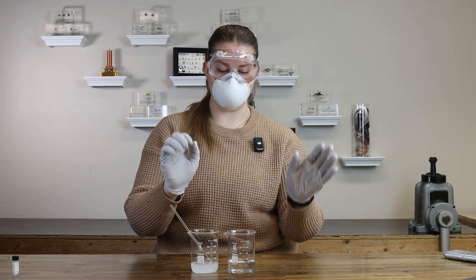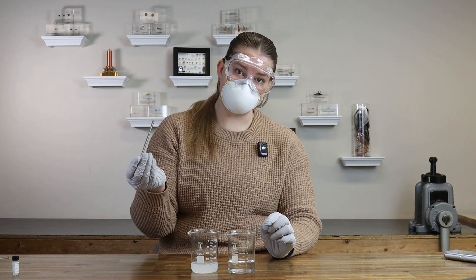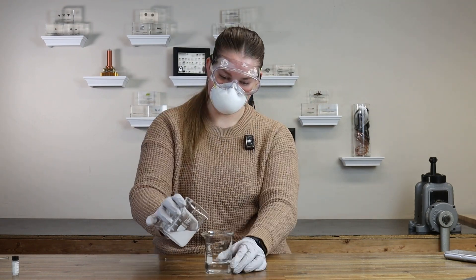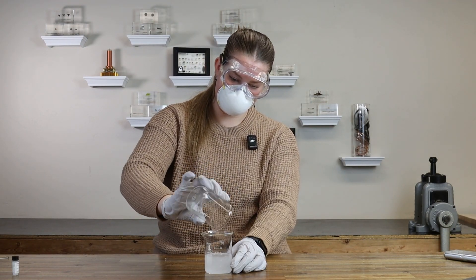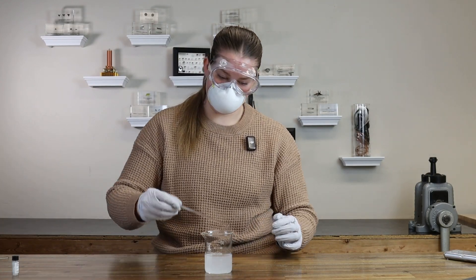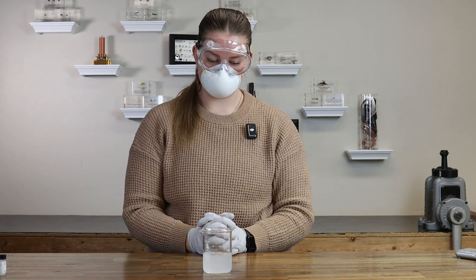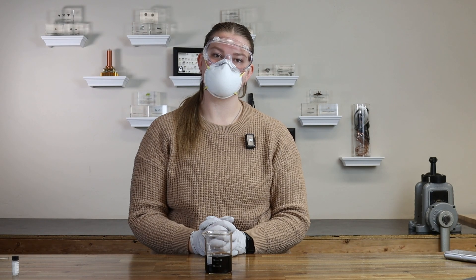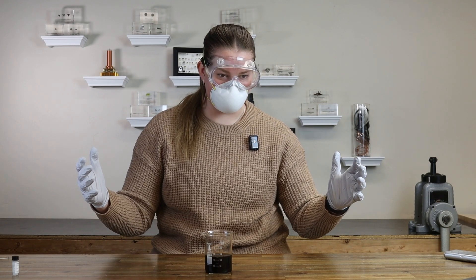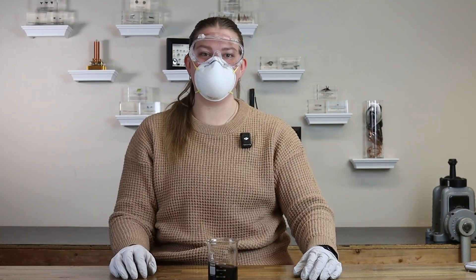So we've got our two solutions here — solution A, solution B. What I'm going to do is pour solution A into solution B, briefly stir, and sit there and watch the magic. Thank you for coming to the channel. Guys, look at how cool that is — it literally just, you know, gets me every time.